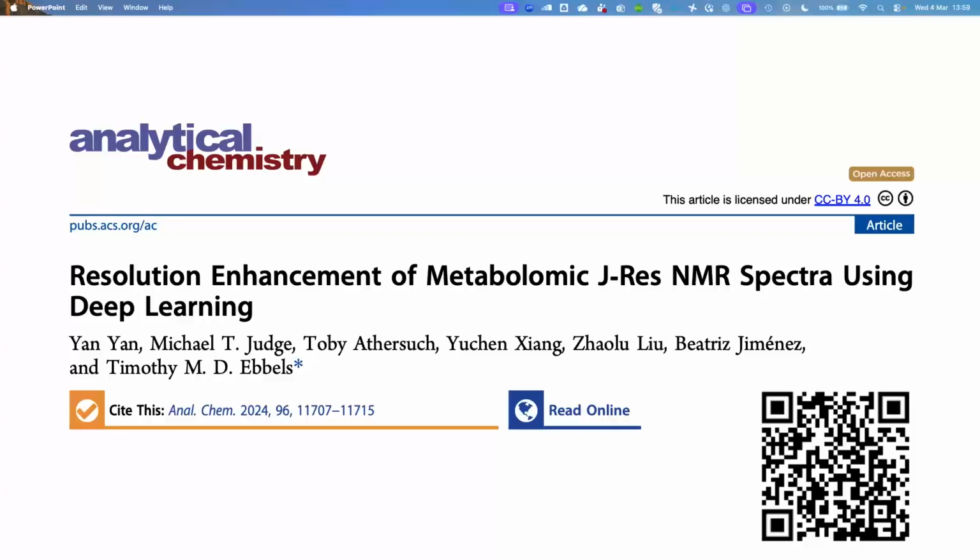How well does really simple approach like that work? So it works to some extent, but it's a long way from perfect, I suppose, is the basic answer. Essentially it's a deconvolution problem, and people have worked on this. I've worked on it as a postdoc using Bayesian approaches to deconvolution, and other people have done lots of things. The problem is that a spectroscopist will tell you their peaks are all well characterized and they get the right peak shape and peak width all the time, but in reality that's not as controllable as people want it to be.